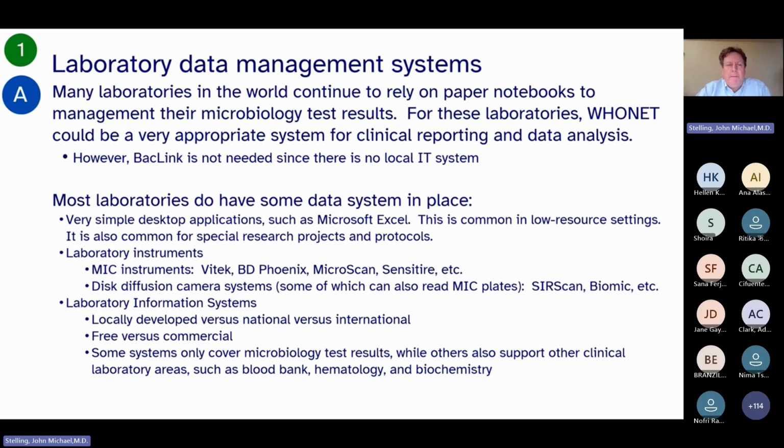So where does BacLink come in? Laboratory data management systems. Many laboratories in the world use paper notebooks. They do not have an IT system. They don't have a database. Everything goes in notebooks and medical records on paper to go back to the clinicians. For the laboratories I just described, you do not need BacLink. You need WHONET. So you use WHONET for data entry, data analysis, clinical reporting, and you do not need BacLink because there is no local IT system.